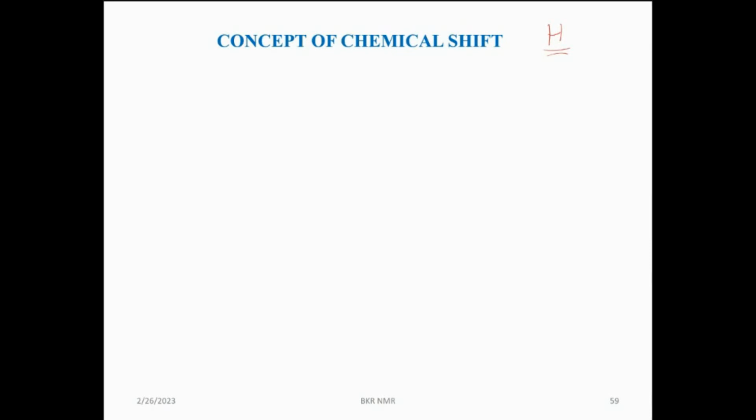So I am shifting from where? I am shifting from the TMS. So here we take the TMS as the reference point.